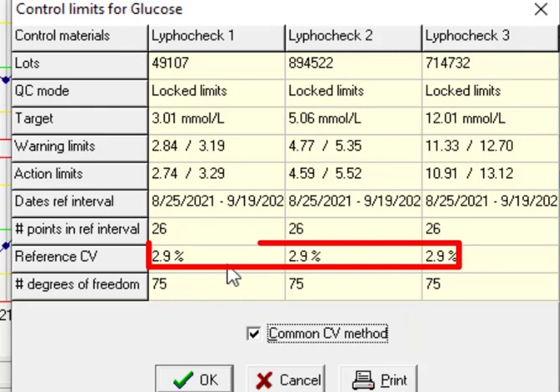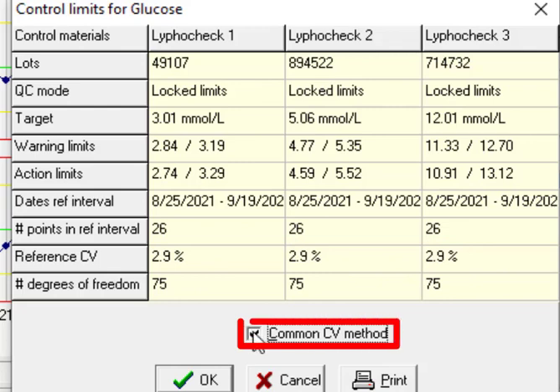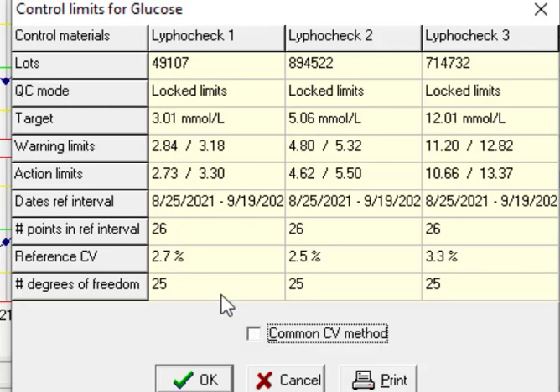We see it is common and the same for three different levels. Pick that up. You see there are different CVs.